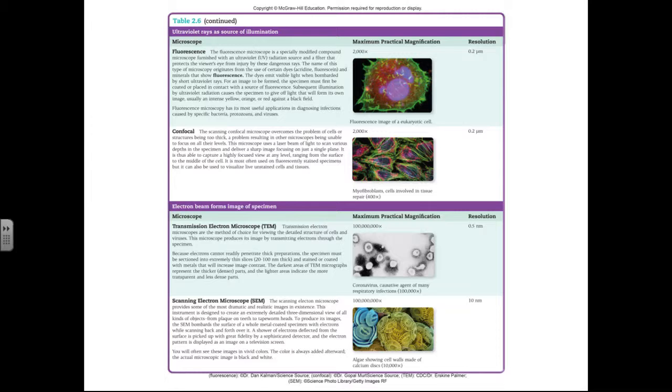A confocal microscope is going to be able to take an image at different planes of field along the z-axis. A confocal microscope can be combined with a fluorescent microscope to allow you to cause the cell to light up or different parts to fluoresce different colors, and then you can take different pictures at different slices throughout the cell. Sometimes it's referred to as a z-stack as we are working with the cells. A confocal compared with a fluorescent microscope gives you lots of those really cool GIF images, so you can see different layers of the cells within a slice of tissue.